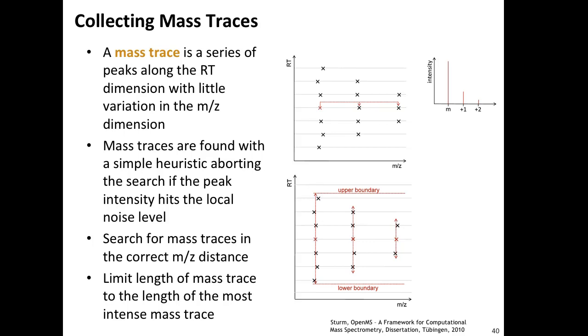What that also gives us are so-called mass traces. This here now is, again, each of these crosses is a peak. We have M/Z and retention time here. And what we usually see is that we have these isotope profiles that are eluting. Why are these triangles? Why aren't they squarish? This here is a monoisotopic, +1, +2. Why are there shorter ones?